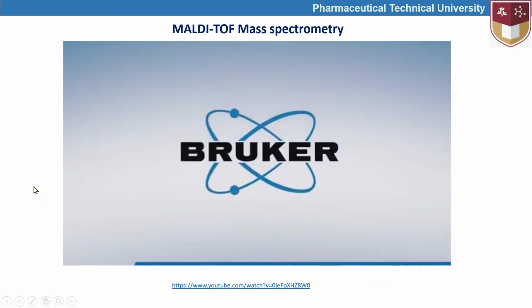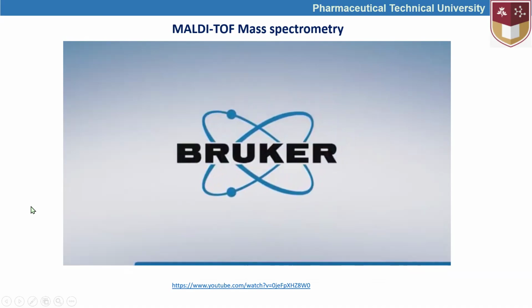Here in this video, we watched how the MALDI-TOF works and identifies the ions.